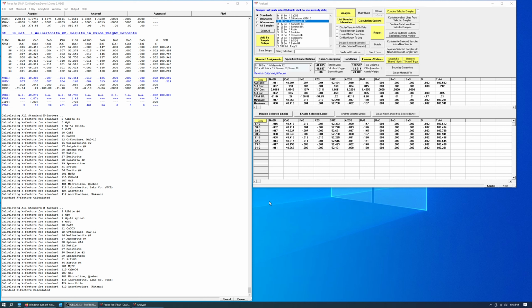This video is going to show you how to assign mean atomic number, or MAN, background fits for calculating the background based on a single point on peak measurement versus high and low peak. If you're not familiar with mean atomic number backgrounds, I suggest you check the description for links on more information and/or some videos on this channel that will go into more detail.